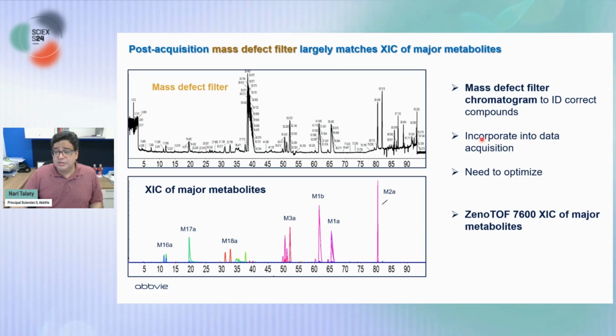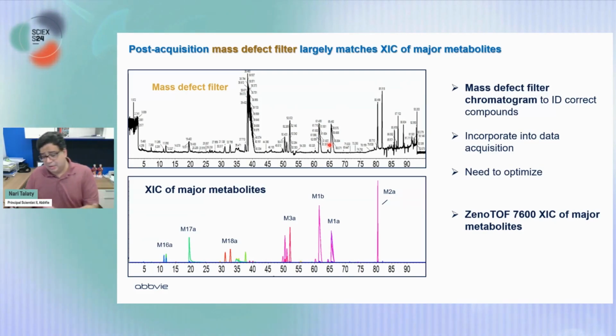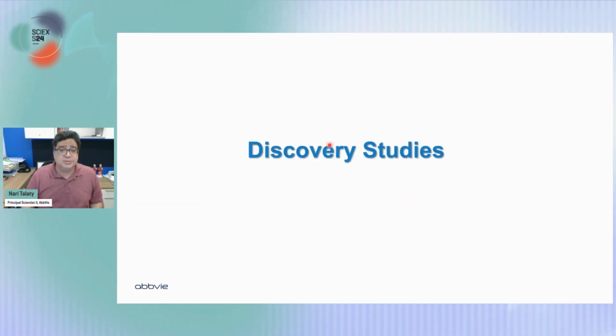We need to incorporate this into our data acquisition. This is something our director from our team, who has been doing this for 20, 30 years, told me is really powerful and we need to use. So we are beginning to scratch the surface. We are beginning to use this in our acquisition workflows now. We have always used this in post acquisition, so I'm not showing that data yet. It's really powerful to have three ways to acquire the data and three ways to process the data. It really makes it difficult to miss things.